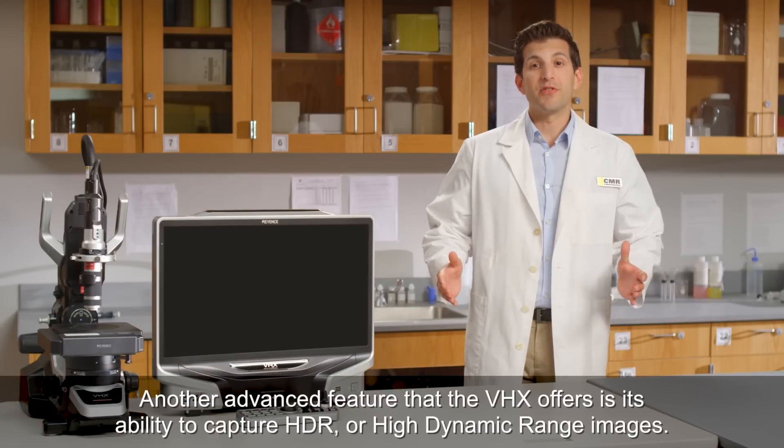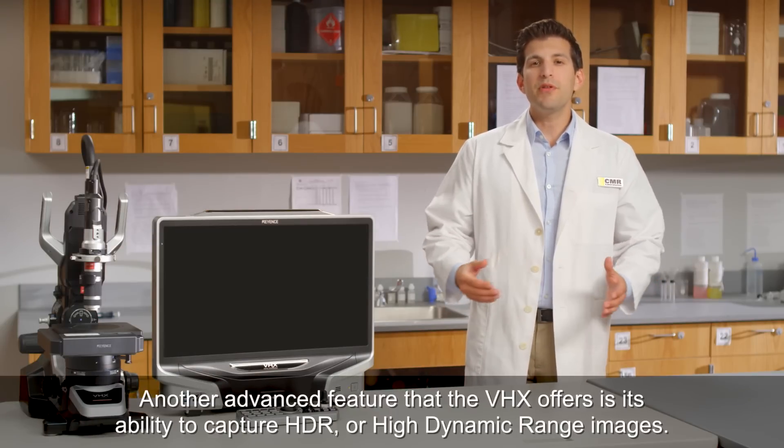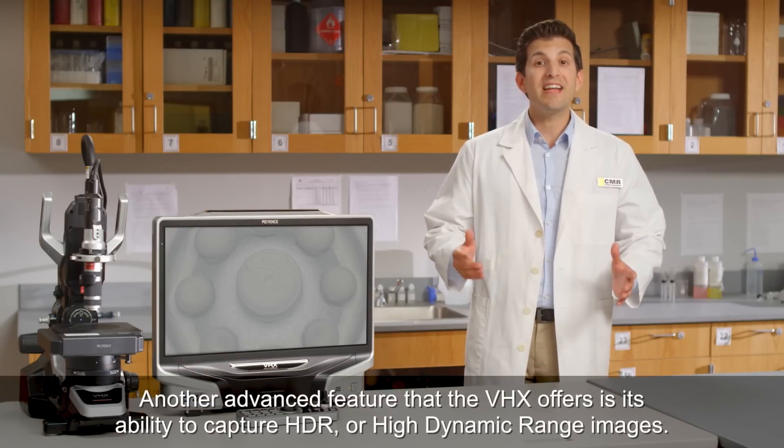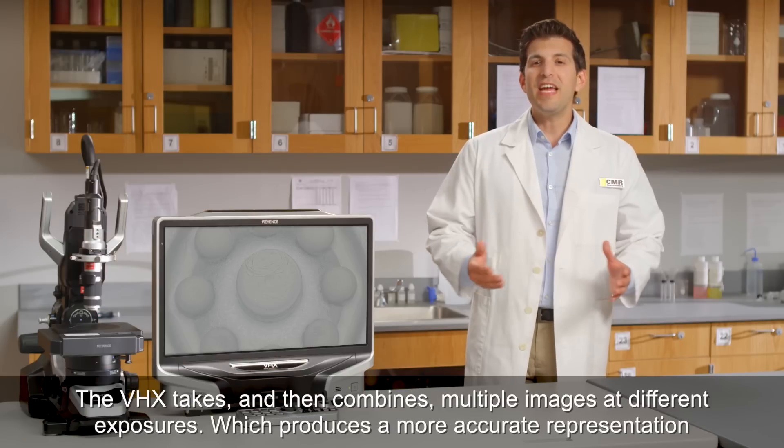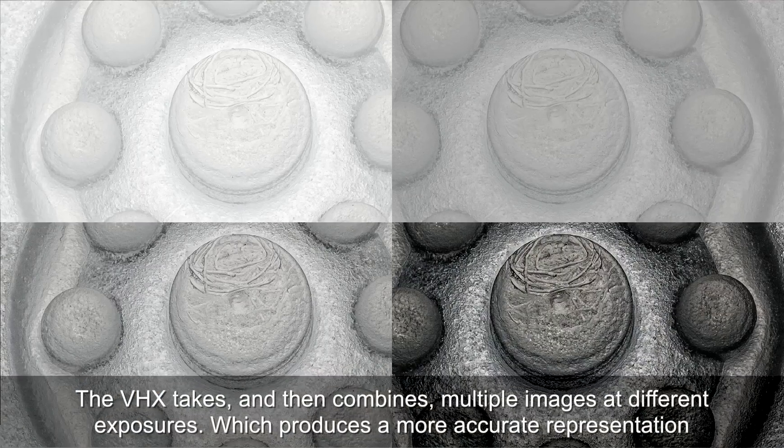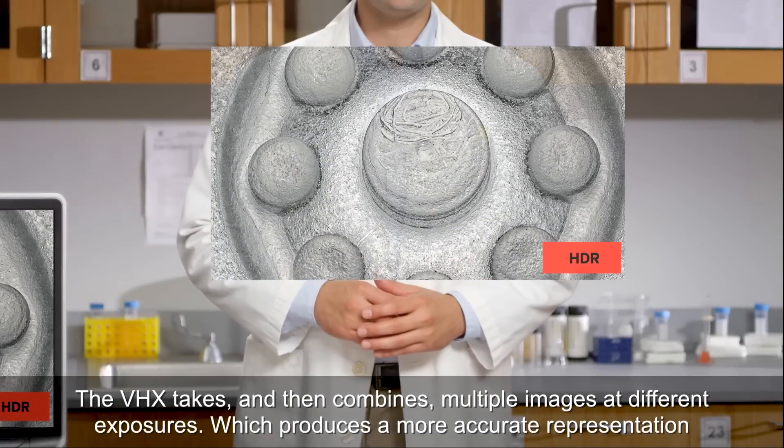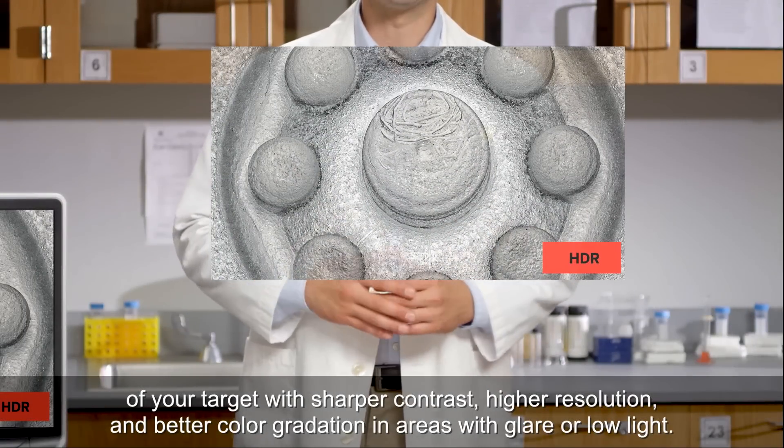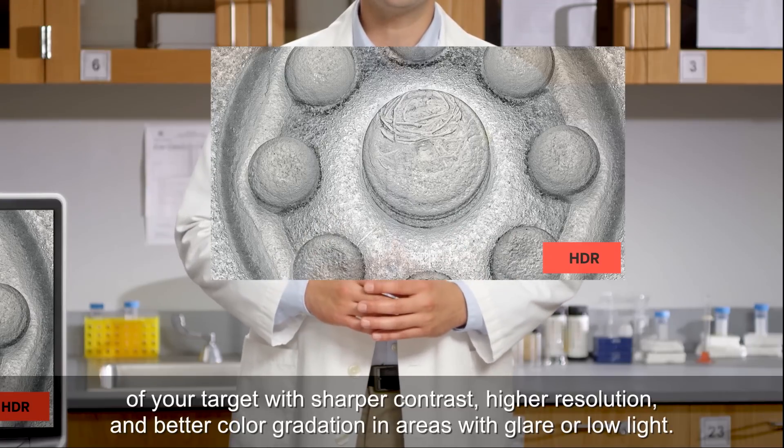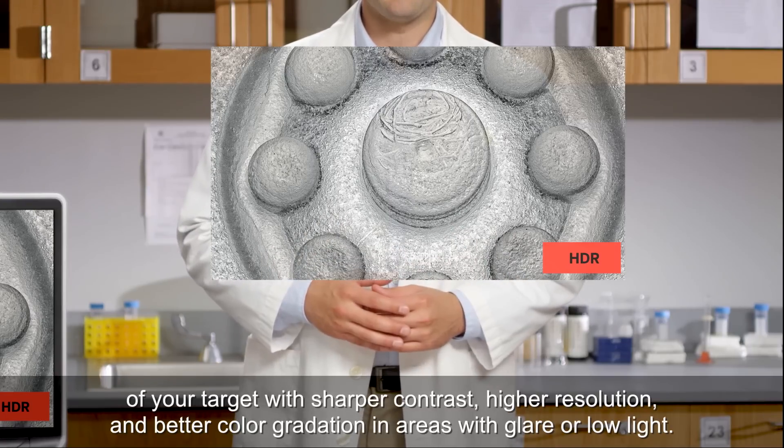Another advanced feature that the VHX offers is its ability to capture HDR, or high dynamic range images. The VHX takes and then combines multiple images at different exposures, which produces a more accurate representation of your target with sharper contrast, higher resolution, and better color gradation in areas with glare or low light.